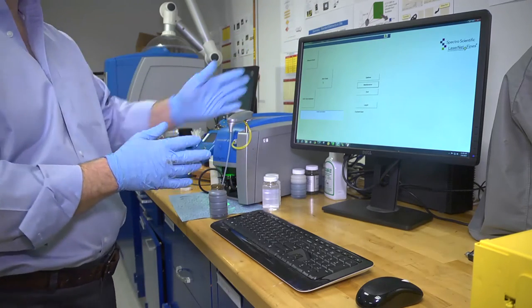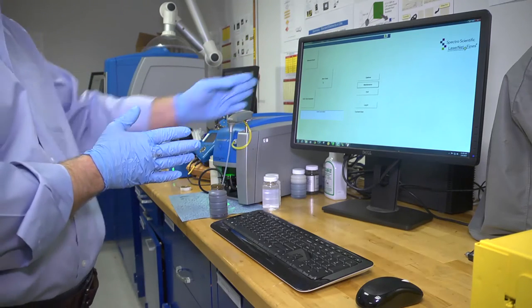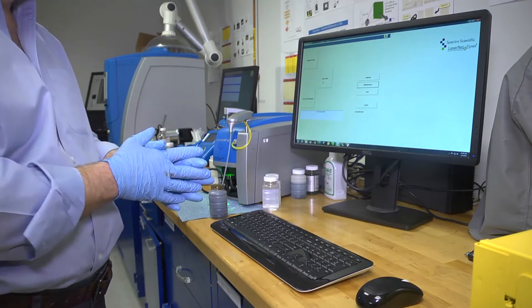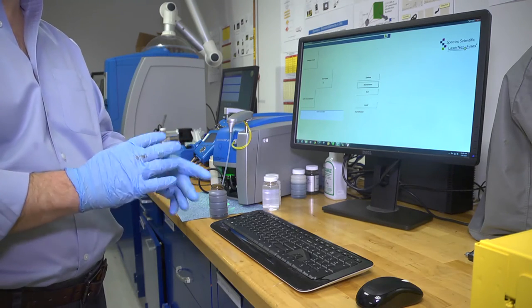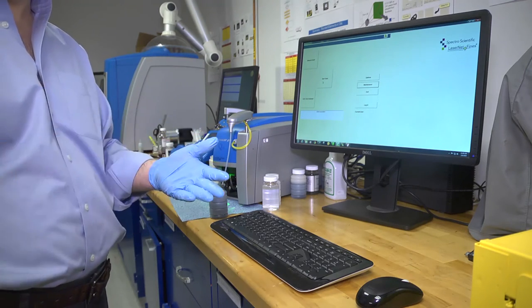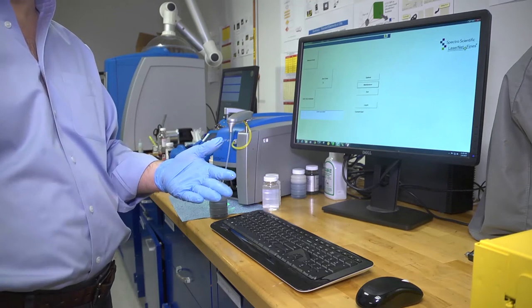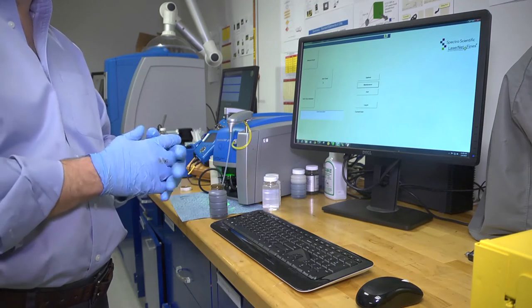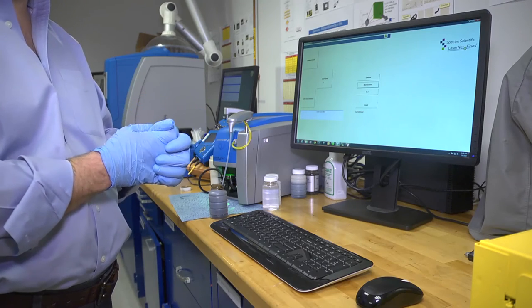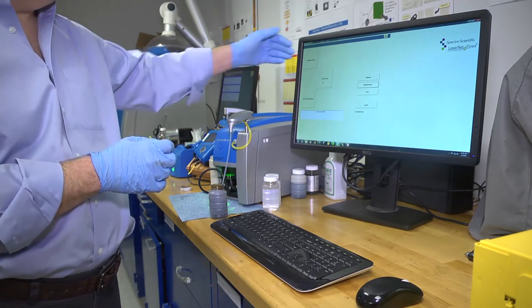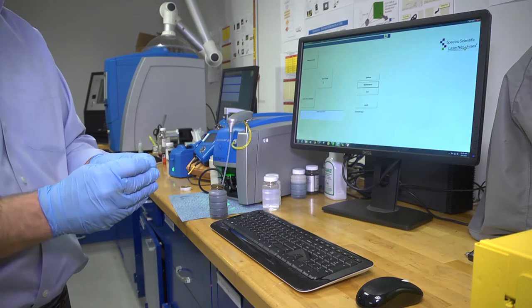There's two different ways of measuring a sample. One is a simple start test, which you would use if you're doing a sample whereby you will enter a sample number that can then be logged with the sample results and tracked. Another way of measuring a sample is for a sample that's taken from a specific asset. In that case, we could use the measure asset screen.